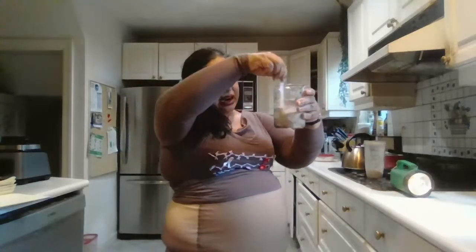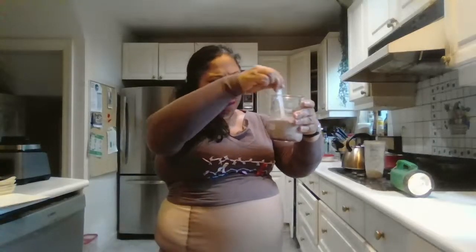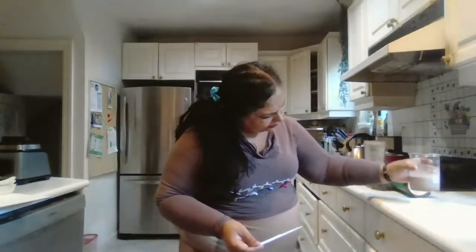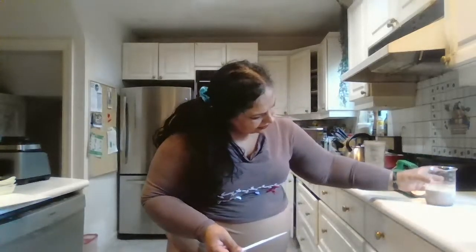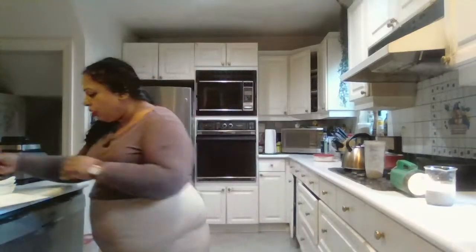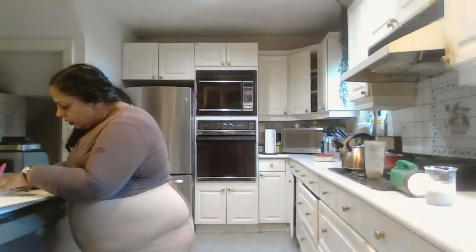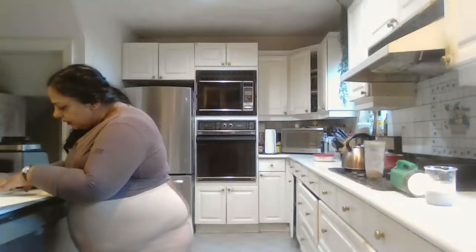It's become darker, all mauve, violet. I'll keep this here. So 1 teaspoon of copper sulfate, cupric, with 40 grams of oats in 200 ml.